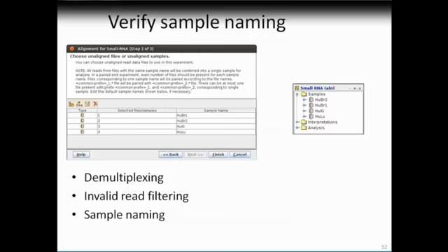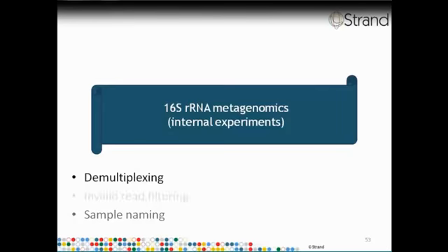So what one would want to do next is to explore the data at different levels of this particular taxonomy tree. One could try to display the results in a traditional tree structure. The tree structure is good for exploring the taxonomy, but it is hard to indicate the relative proportions of the reads that align against different members of the taxonomy. So one way of showing the proportional representation is via a drillable pie chart. The individual pies indicate the fraction of reads that align against that particular bacteria. In addition, one can double click on the pie, and it will show the next level of the taxonomy. This is one experiment we are carrying out with how to explore the metagenomics data in an intuitive manner.